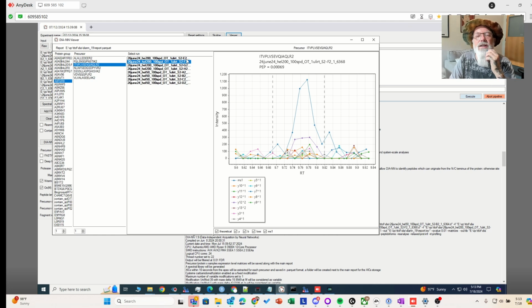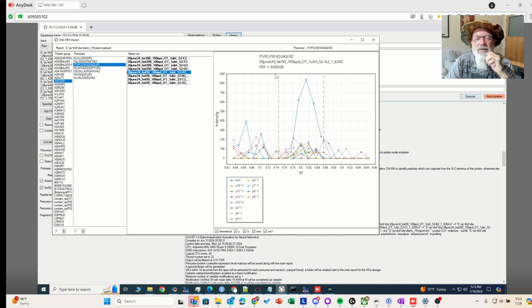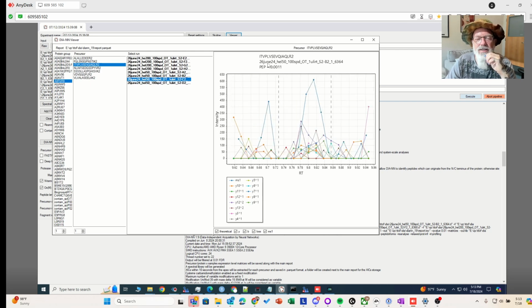Oh, that looks nice. You can see it's only showing you the fragments. It doesn't, oh, look, no. Here's the MS1. It looks like it's the MS1. Okay, that's cool. All right, it'll give you the posterior error probability. So this will be your precursors and your fragments all in one go. And then these lines are what it's actually integrating to get the data.